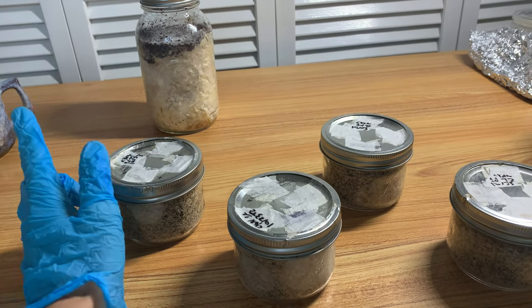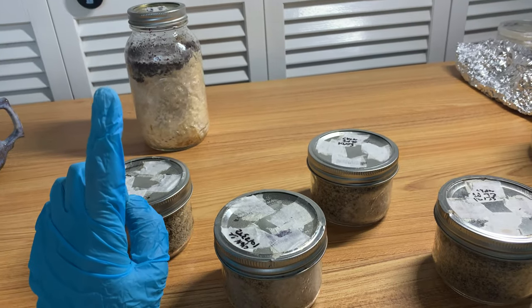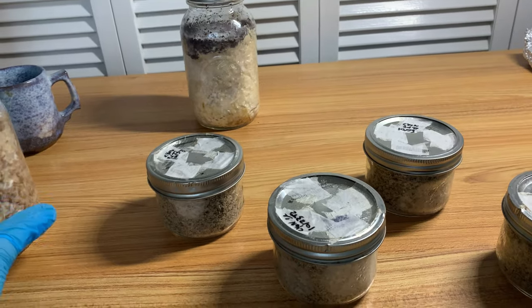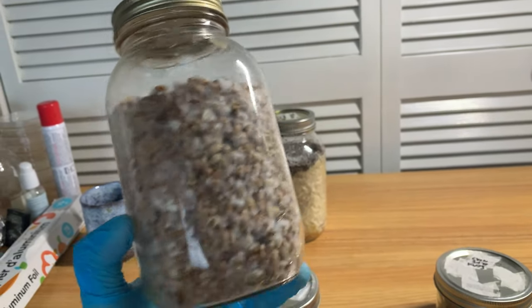I wanted to give you guys a quick update because I actually did cut it out of the video, but what I actually inoculated this with was an experiment. So I took a jar - it was about half the size of this jar. I looked for it so I could show you guys, but I can't find it. Basically, it's a mason jar that's like half the size, like a pint jar.